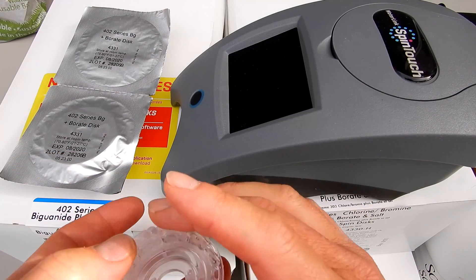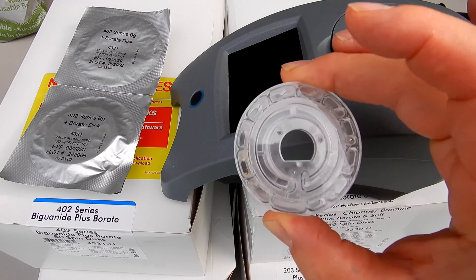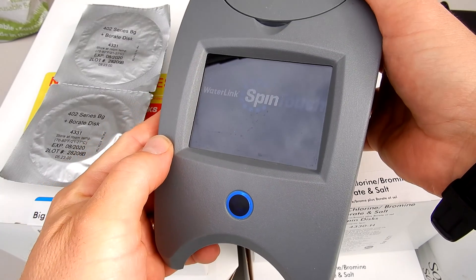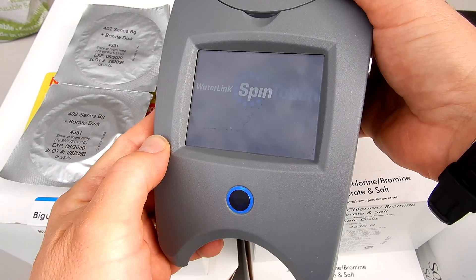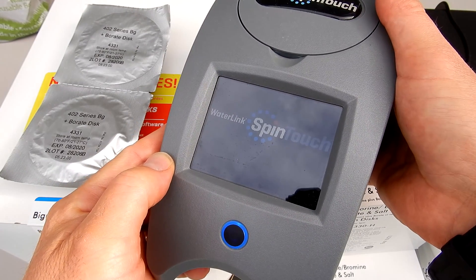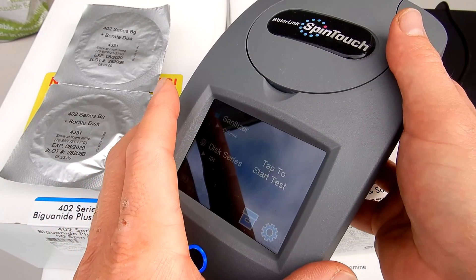In this video, I'm going to briefly go over the different spin discs that you can use for your Waterlink Spin Touch by Lamont. The Spin Touch is the premier photometer water tester — it does up to 10 test factors in 60 seconds — but there are various different discs that you can use with the Spin Touch. I'll go over those in this video for you.